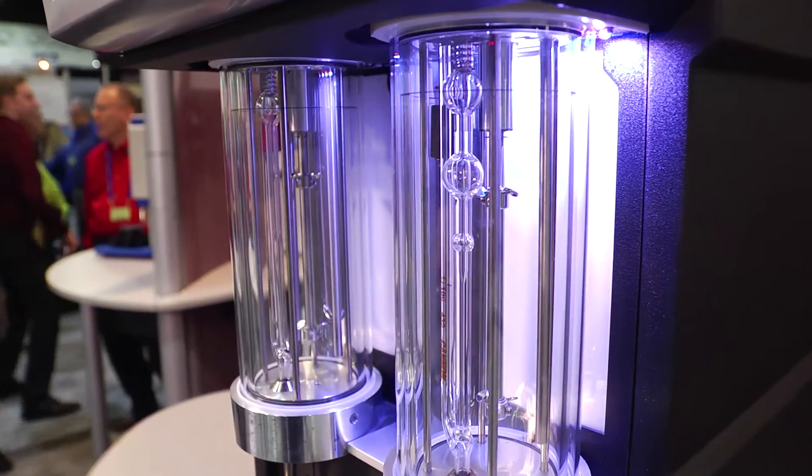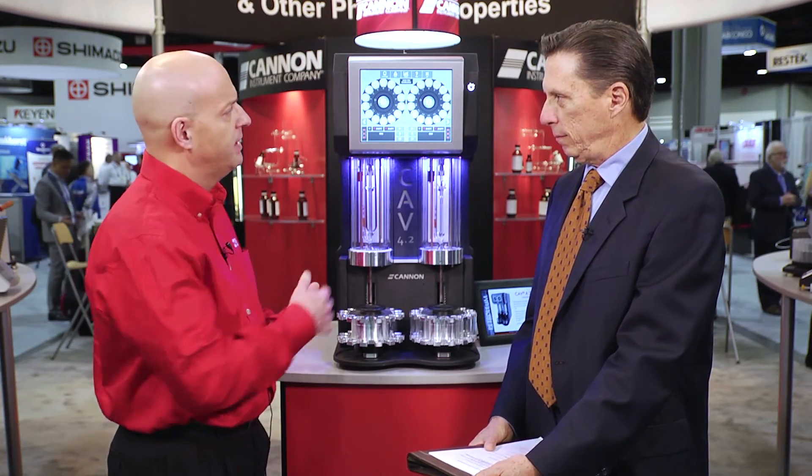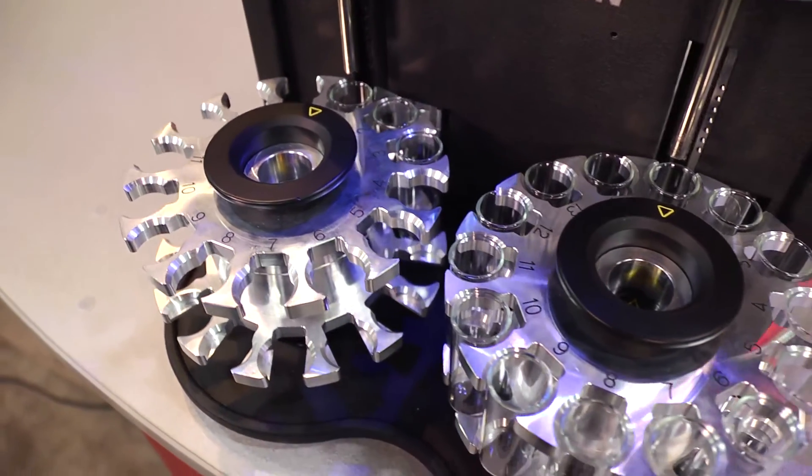Can you tell me more about the washing and drying features? The system integrates fully automated tube washing and drying, which affords up to three solvents per tube. A total of six solvents can be plumbed to the CAV 4.2 and then selected based on the sample type being run. Because of the system architecture, we have the ability to select multiple test methods and mix those multiple sample types on a single tray.